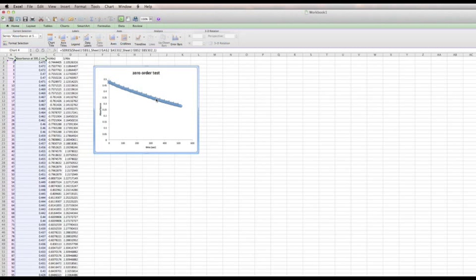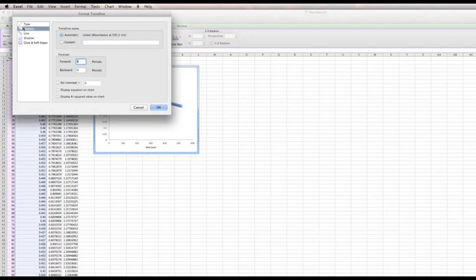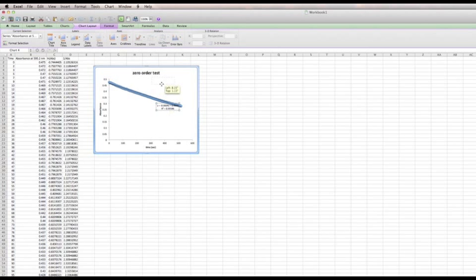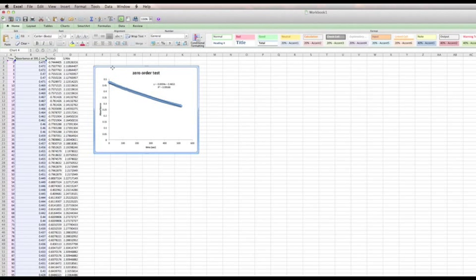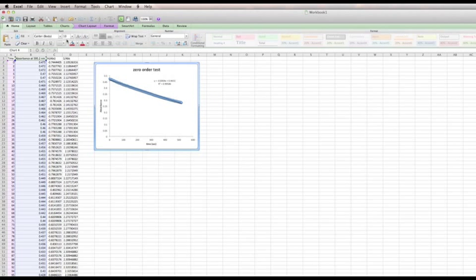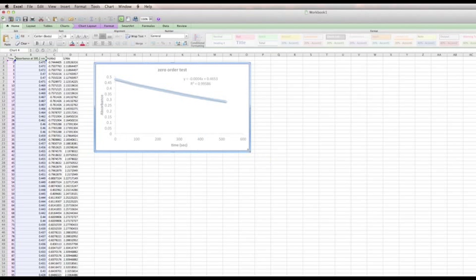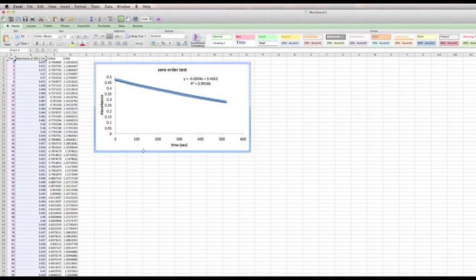The other thing we need to do is add a trendline. Right-click on the data and add a linear trendline, and we want to show both the equation and the R-squared value on the chart. You might also want to make the text a little bit bigger so you can read it better, and maybe make the graph a little bigger. So there's the zero-order test.